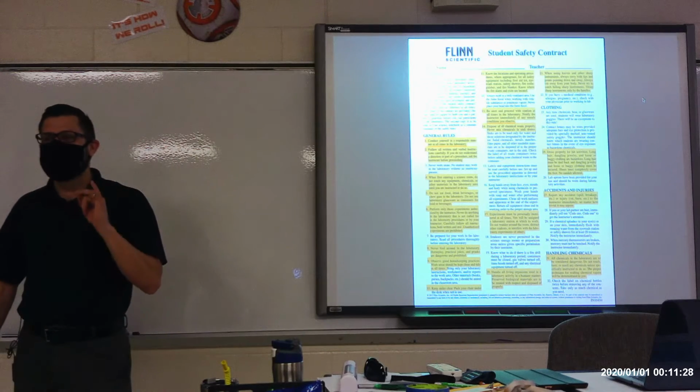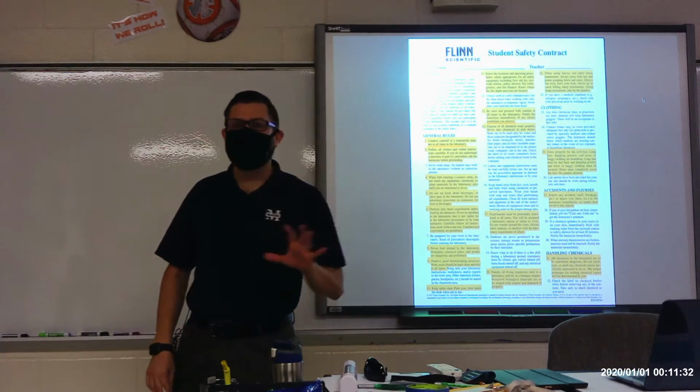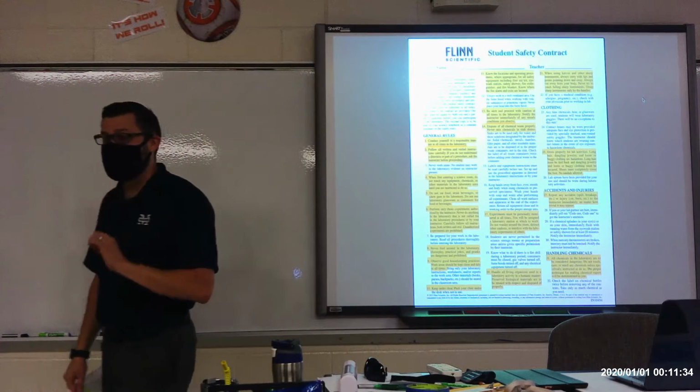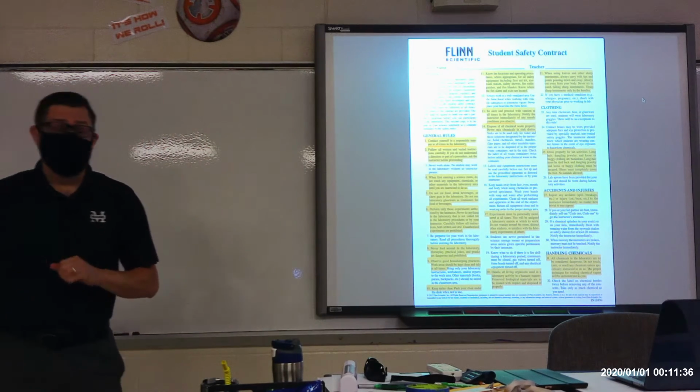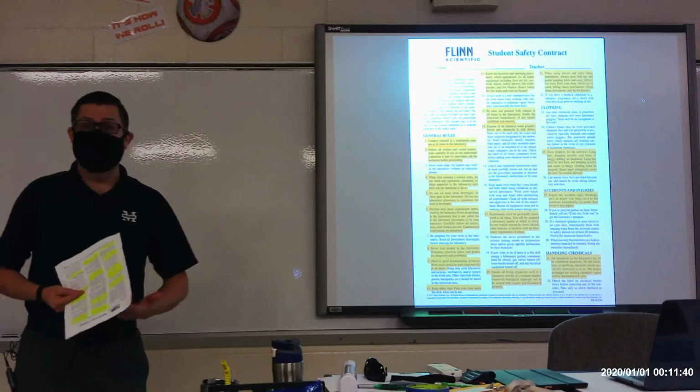Okay, that is never a good idea in a lab setting, because if you don't know what the outcome is going to be, then the outcome might be dangerous. Okay? You always need to assume when you walk into a lab that there is a potential for danger.